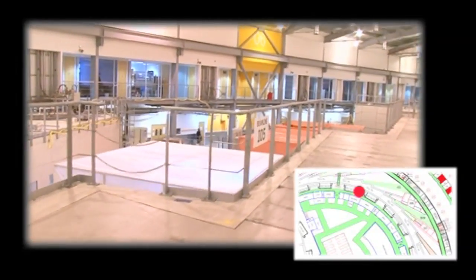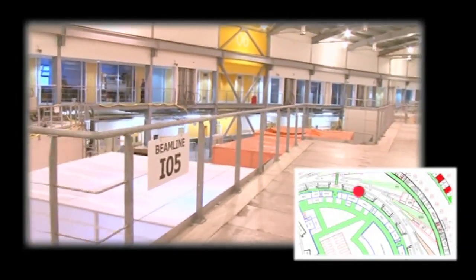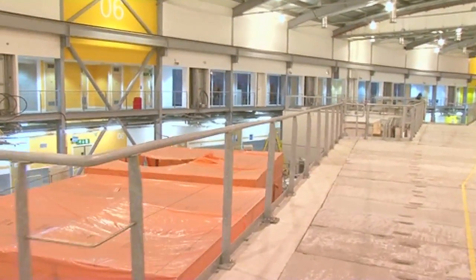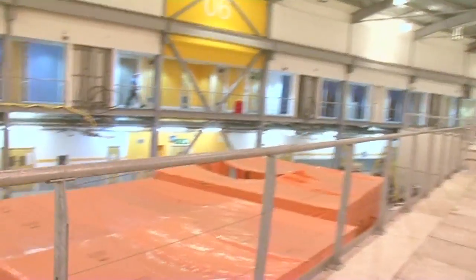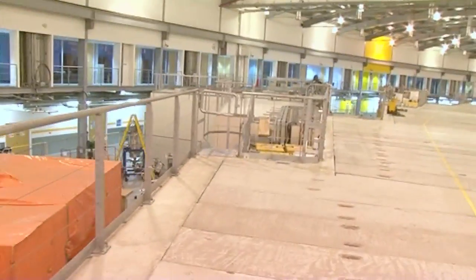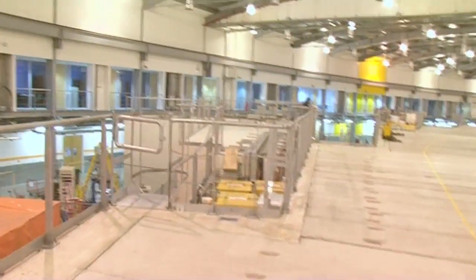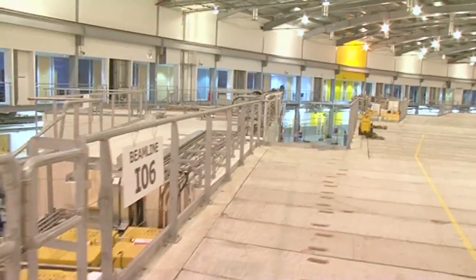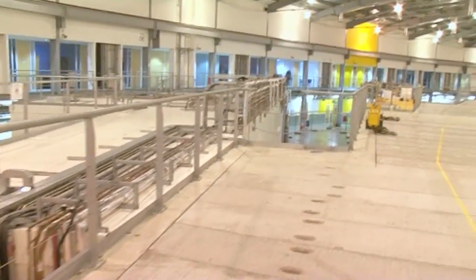This is an area still under construction. All around the top of the ring we have offices where all the scientists and engineers at Diamond are based. On the lower floor is where we have labs and workshops that support all of our operations. Users come and do their sample preparation in these labs and then just walk them across the hall to the experiment station.